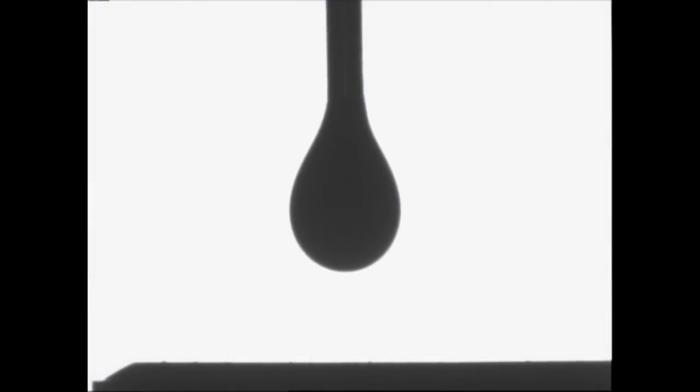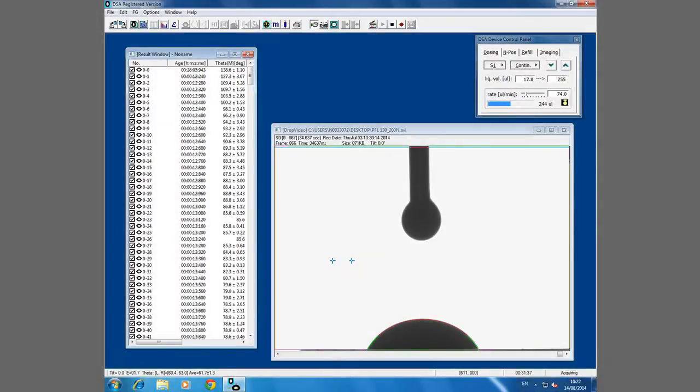In some cases, we may wish to observe the change in contact angle over time, such as in this clip. We can set the software to record a video and then determine the contact angle in each sequential frame.